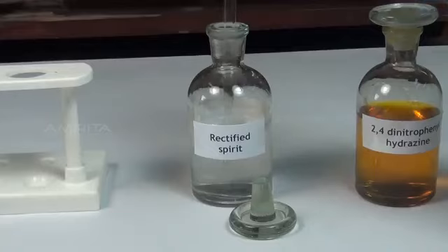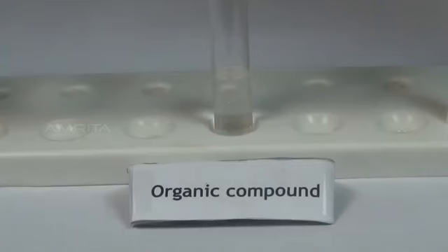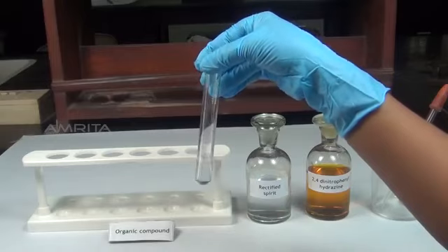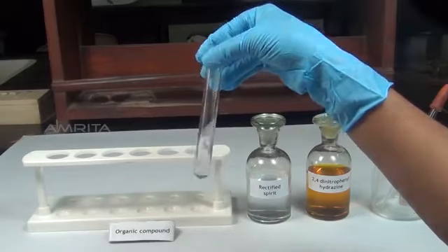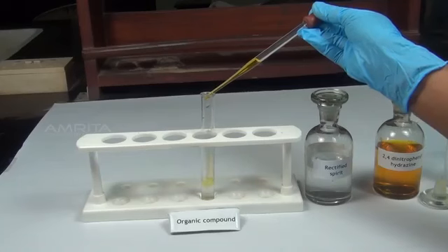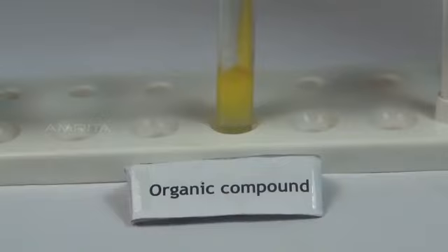To this, add a small amount of rectified spirit using a dropper. Shake the test tube well to dissolve the compound in rectified spirit. Using another dropper, add a small quantity of 2,4-dinitrophenylhydrazine solution into the test tube.